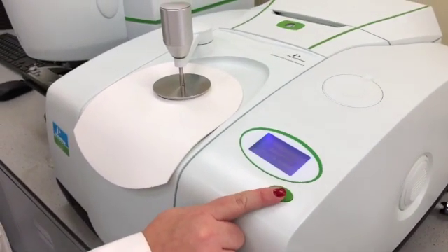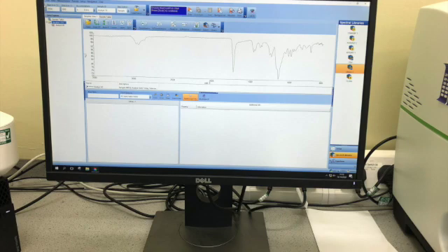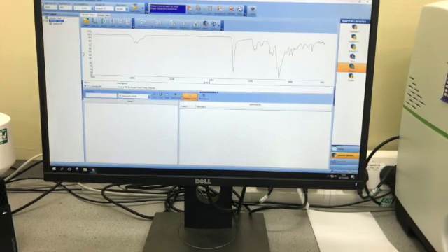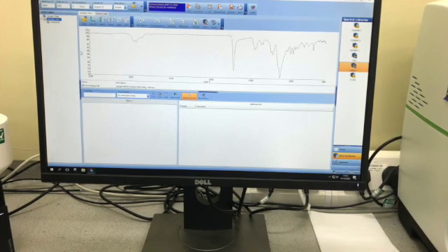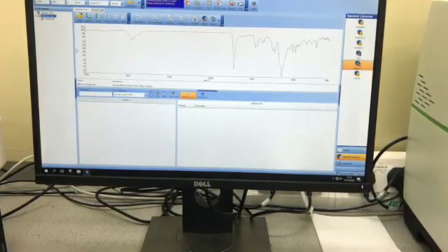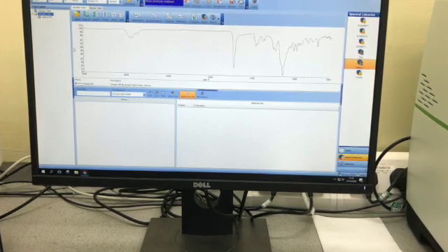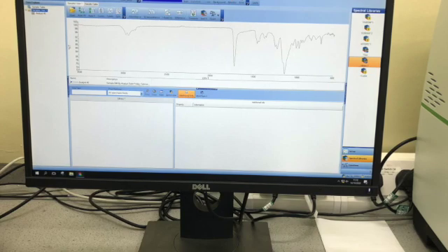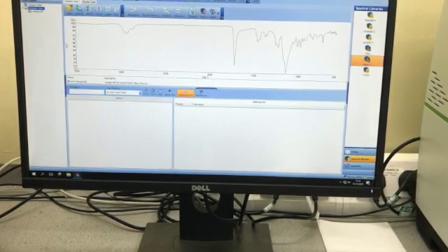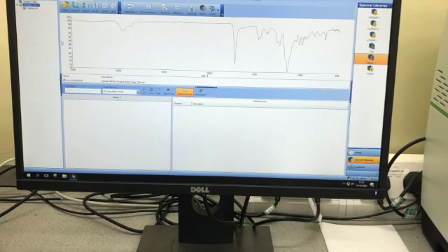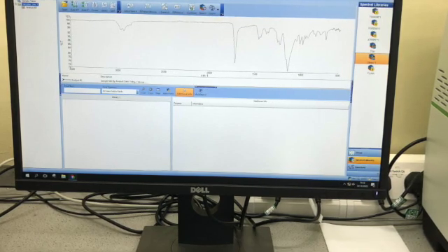Then we will press the green button again and we will have the FTIR spectrum as you've seen prior. In this software, what we can do is mark each of the peaks with the appropriate wave numbers, so that when we print it, we can identify each of the peaks, the wave numbers, and then go on to identify functional groups and perhaps compounds.